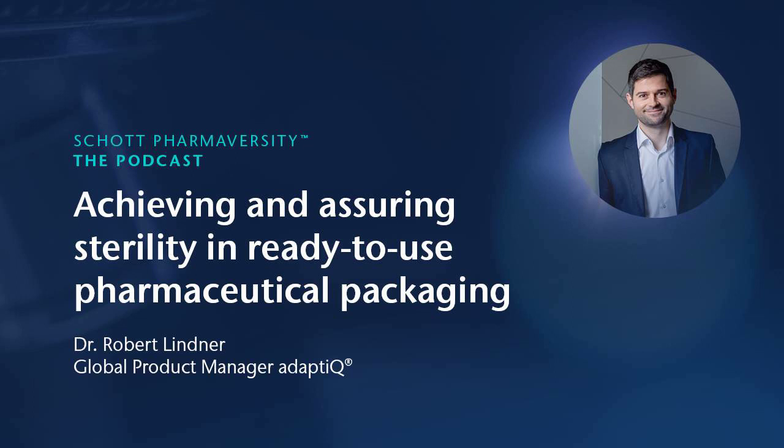To give you a number, the industry standard for sterile primary packaging containers is a sterility assurance level of at least 10 to the power of -6. That means you have a 1 in a million chance to catch a non-sterile product. And I think that already shows you that sterility is really a key parameter for primary packaging.